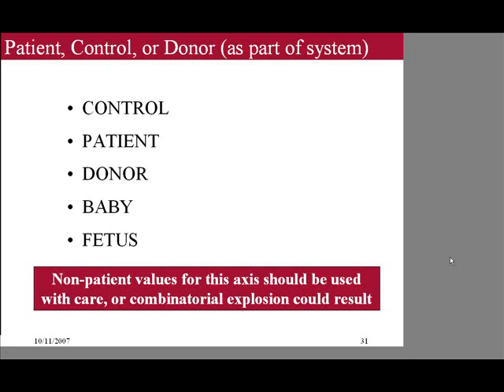So even though potentially you could measure anything in a donor that's measured on a patient, in actual practice there are a smaller number, and so we make the codes that people are really using. It's really an empiric strategy to me rather than derived from a first principle. LOINC is sort of promiscuous in allowing and creating codes that people are actually using.